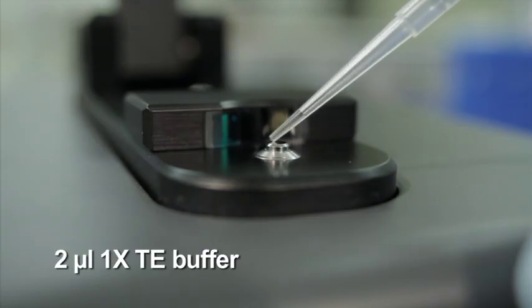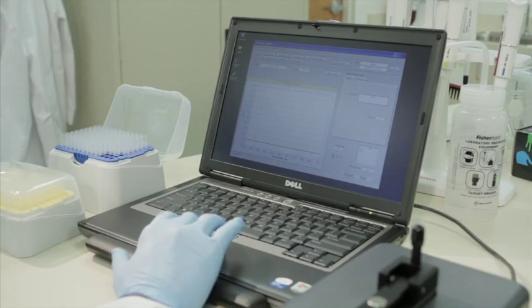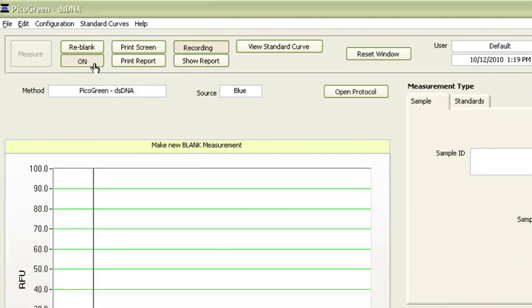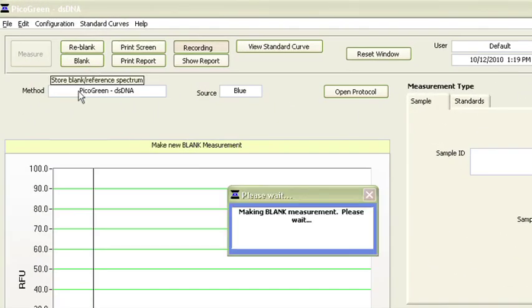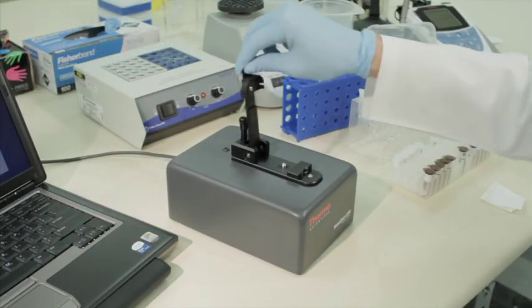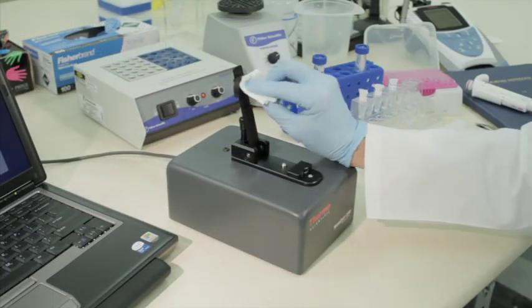Pipet 2 microliters of 1X TE to the lower pedestal, close the lever arm, and select blank in the instrument software field. Once the blank is complete, blot off the blank solution from both surfaces of the sample retention system.